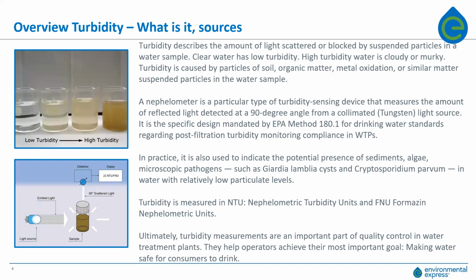Ultimately, turbidity measurements are an important part of water quality in water treatment plants. They help the operator achieve the most important goal, making water safe for consumers to drink.